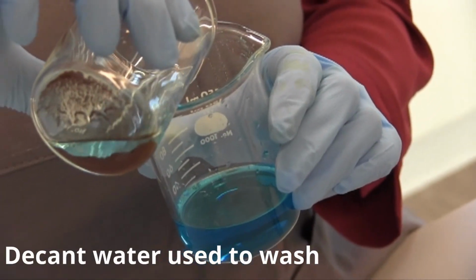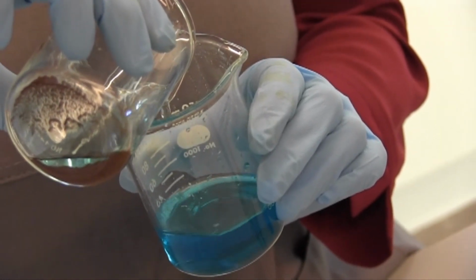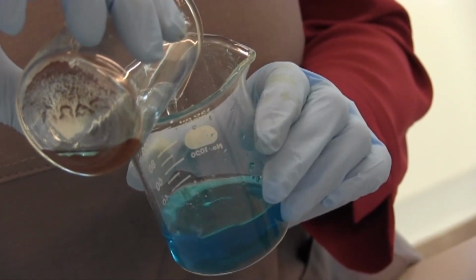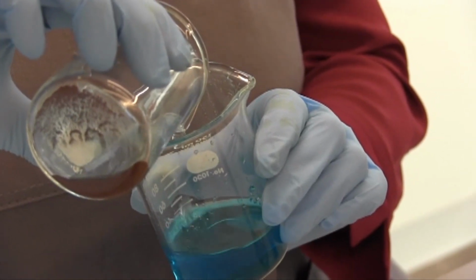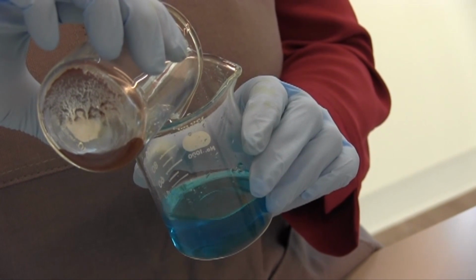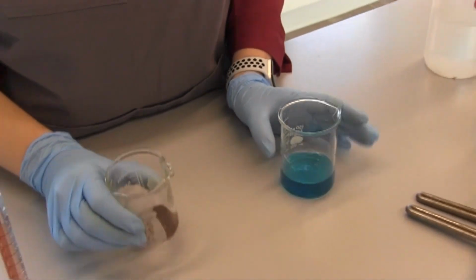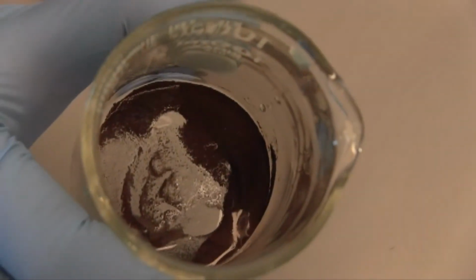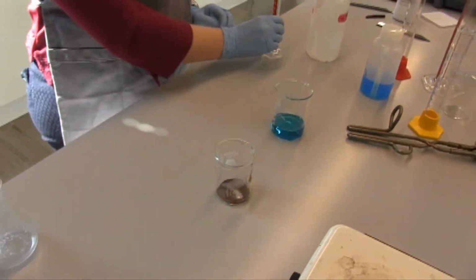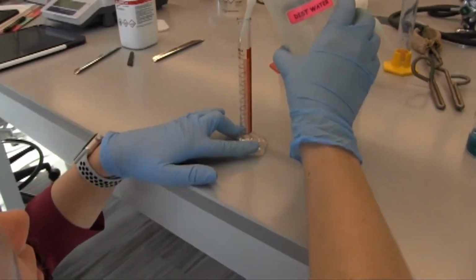Decant the wash water from the copper after the solution has settled. Repeat this process with another wash of 10 milliliters of distilled water.